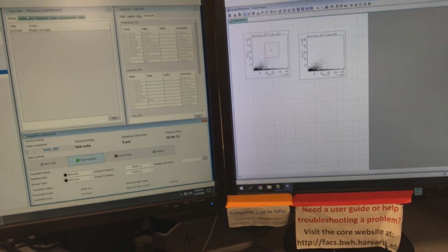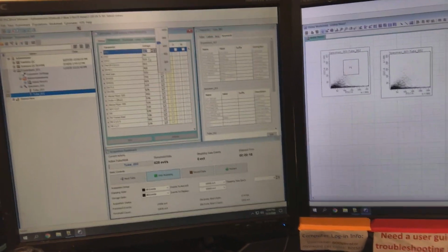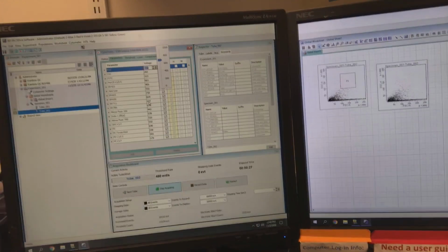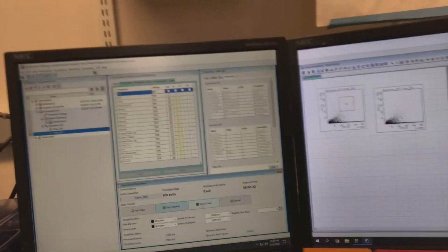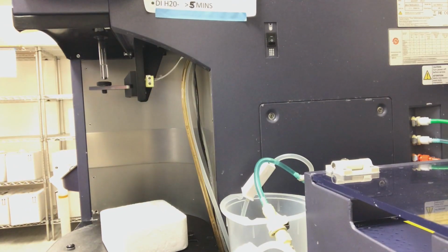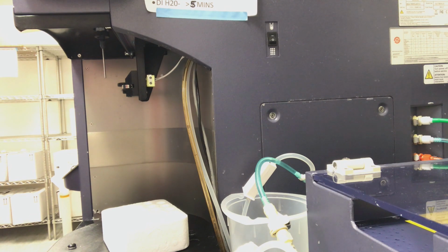And we can record. If this was a compensation tube or a control tube, we can adjust the voltages in our cytometer window. After you've calculated compensation, though, please do not change the voltages, as this will affect your compensation matrix. If this were a sample, we'd record, stop acquiring, and then go to the next tube. And just repeat the process for as many samples as you have.